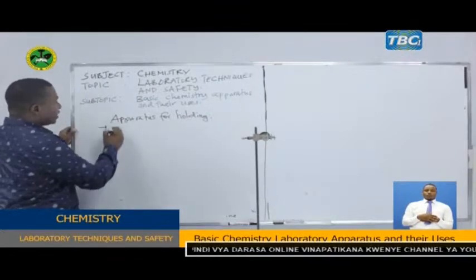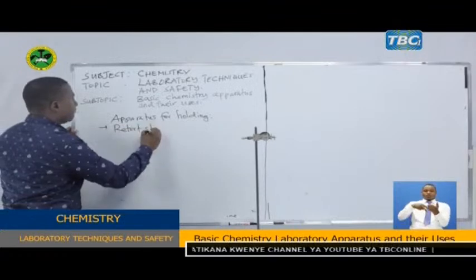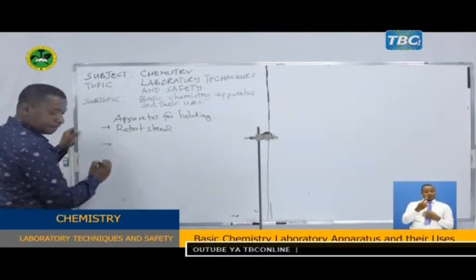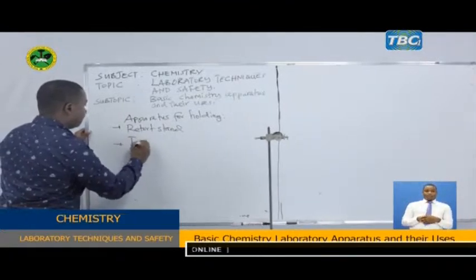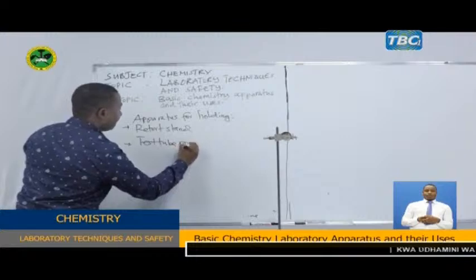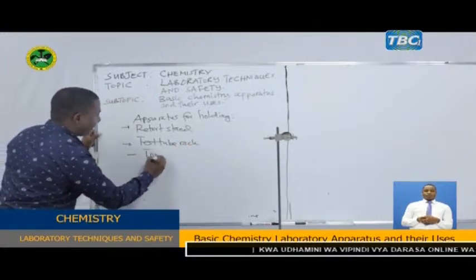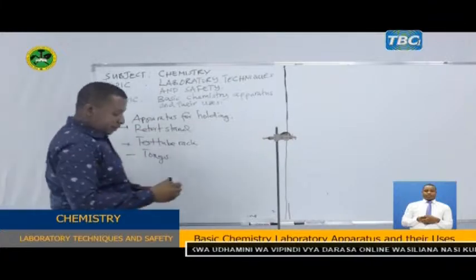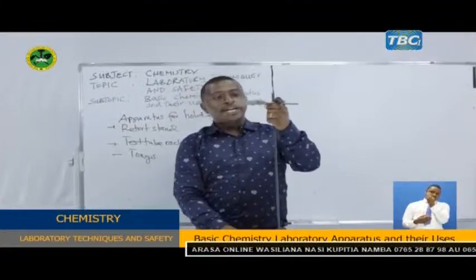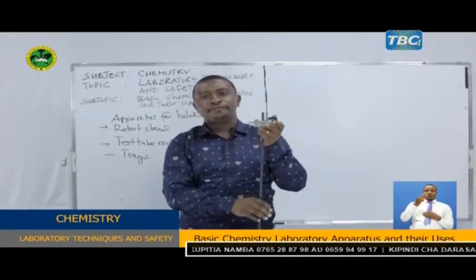We have what is known as a retort stand. Now class, dear students, we have this kind of apparatus here.